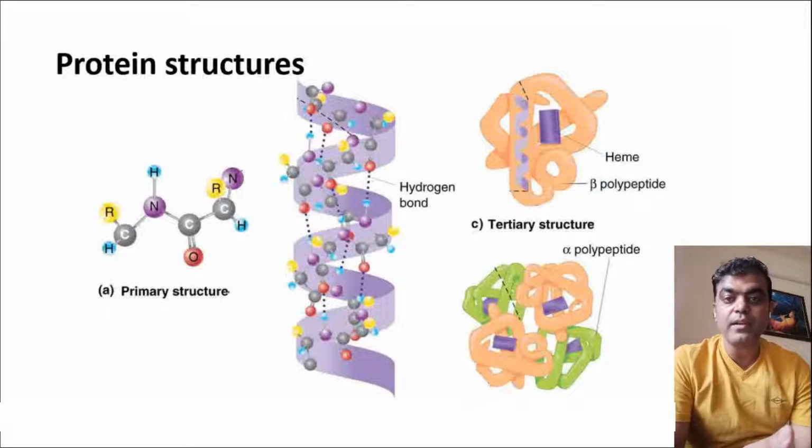Based on the pattern of diffractions we further study the interatomic distance, the angle of diffractions, whether these diffractions are constructive or destructive in nature, and obviously the electron cloud which these X-rays are experiencing.